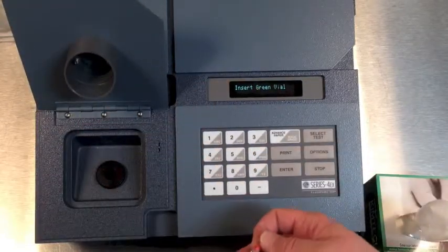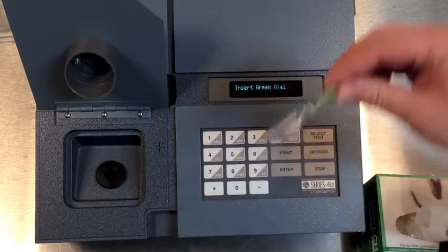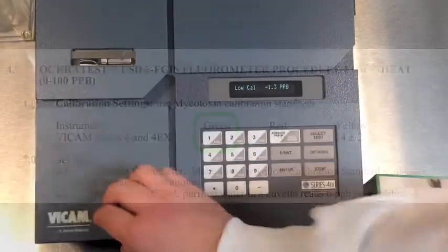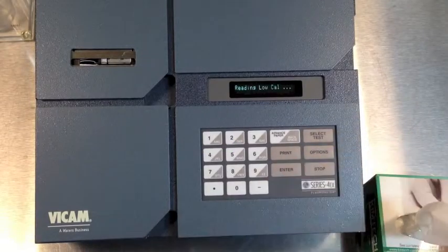The screen will prompt to remove the red vial and insert the green vial. Again, use the calibration settings from the current procedures manual. Once entered, press Enter to start the calibration.